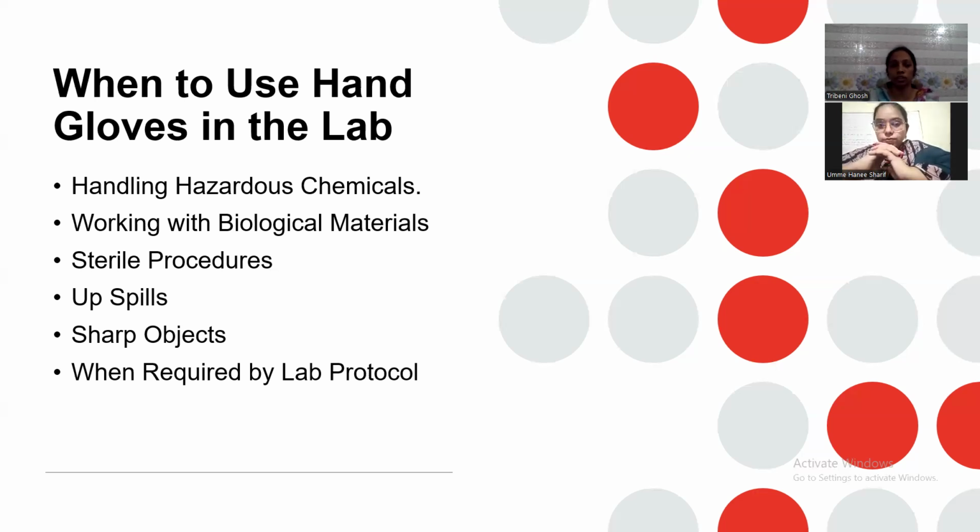Then spills. During your work, you might spill some chemicals, some microorganisms, or biological materials. When we are handling those things and cleaning that space, we must wear hand gloves.